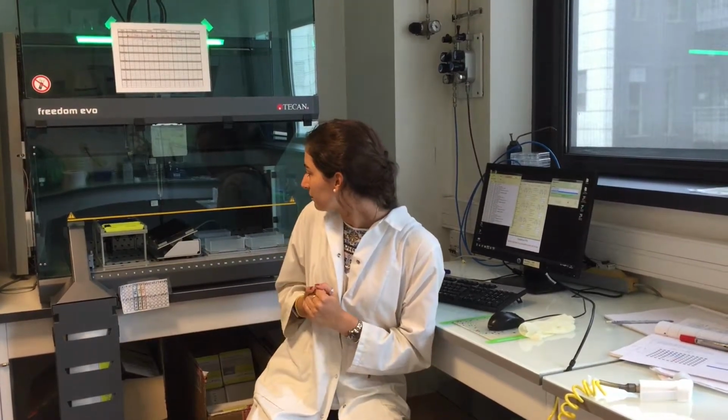So as you can see right here in the robot, it's currently removing the liquid from the 96 well plates and disposing of it in the waste bin. And all that has been programmed into the computer over here. So in just a few short hours, the full film will be built, and it will be able to then be used in further testing.